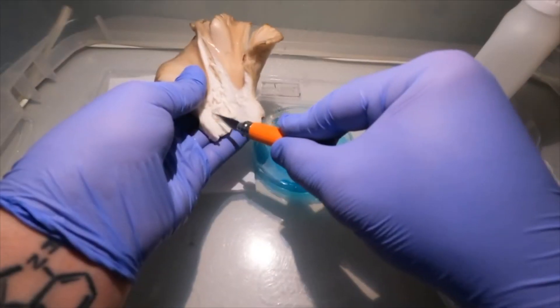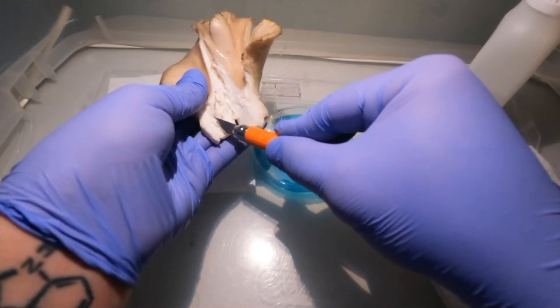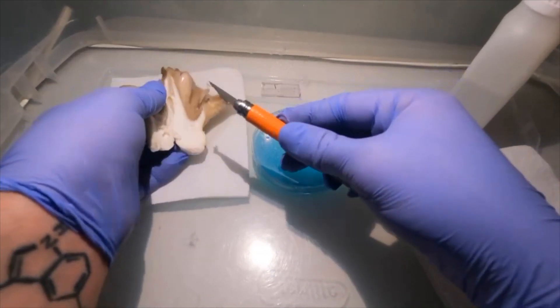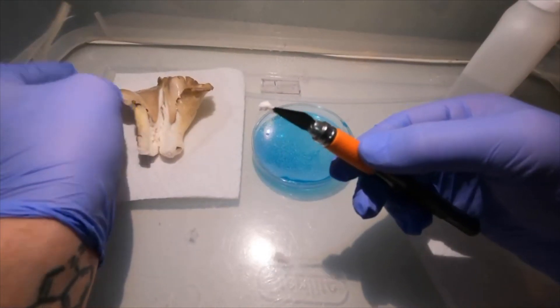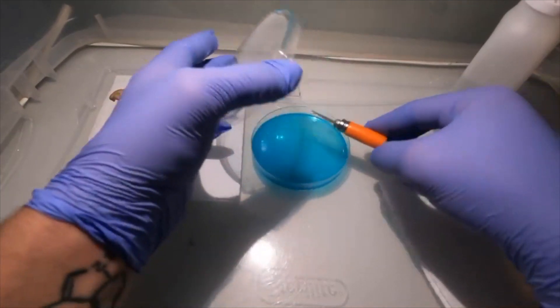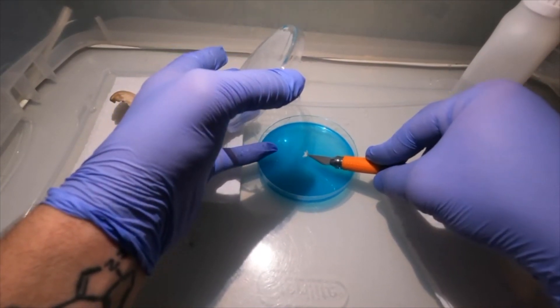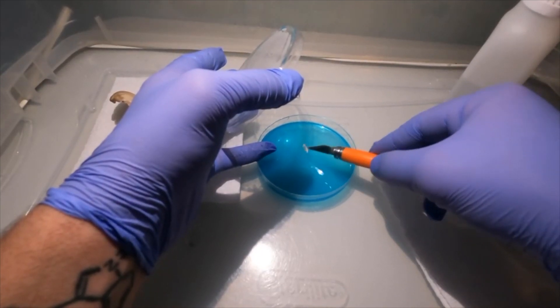After you have sterilized everything, rip open the mushroom with your fingers and use a sterile scalpel to cut a little piece from the center and put that on the agar dish. Try to do this part as fast as you can to minimize risk of contamination.